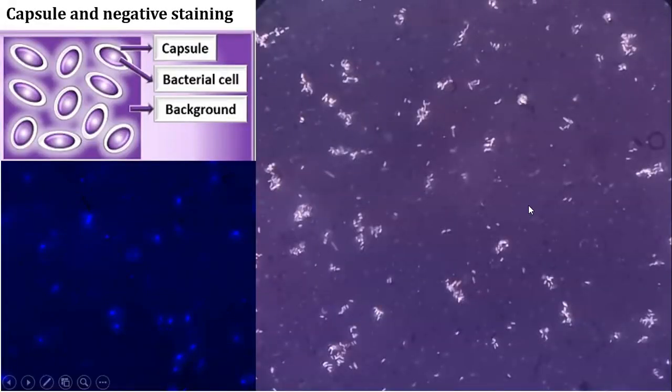This is an example of capsule staining. What we are looking at is a translucent blue color, induced by copper sulfate, that is staining the capsule present around the bacteria. We are using a negative stain, so between the background and the bacteria, you should be able to see this translucent color. Not like this; something like this should be avoided. This is the ideal way to take the capsule staining.